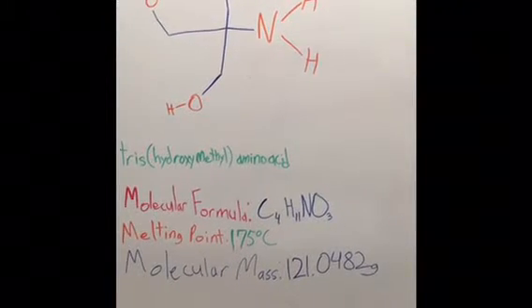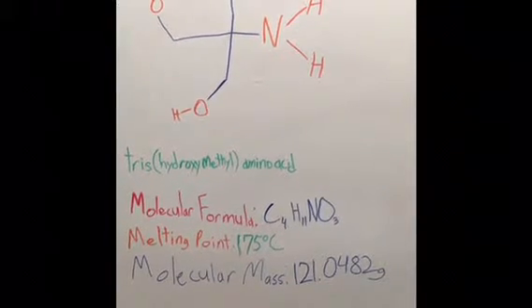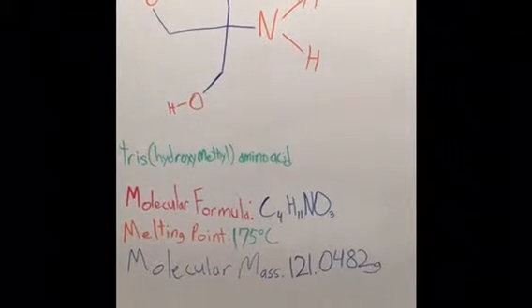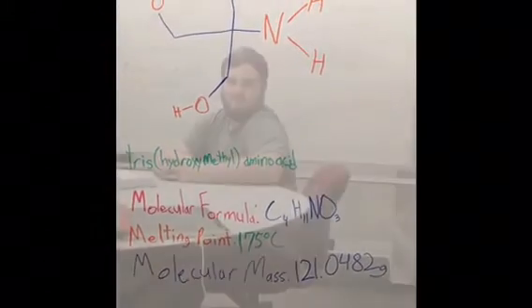These two functional groups coincide with the peaks that are present on the IR spectroscopy, reinforcing our thought that this is the unknown compound. Also, the melting point is only 2 degrees Celsius off from our unknown's melting point, which is further evidence that this is our compound.